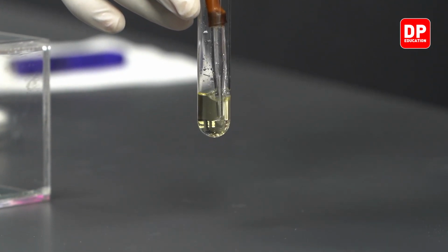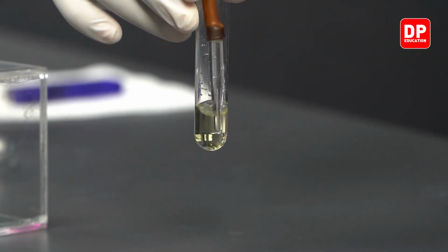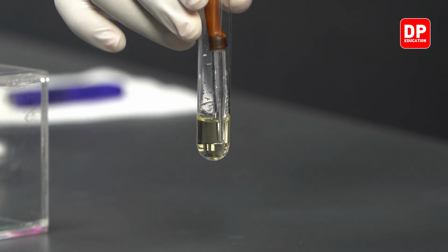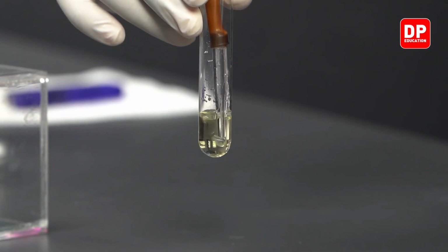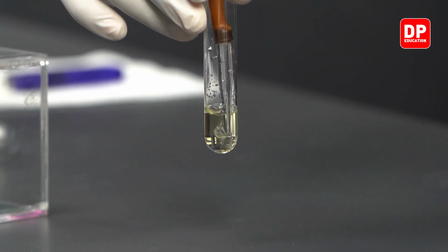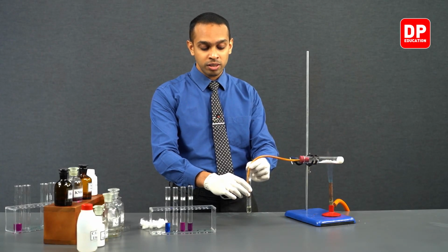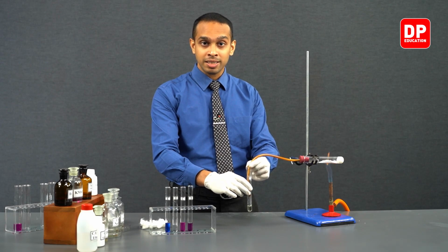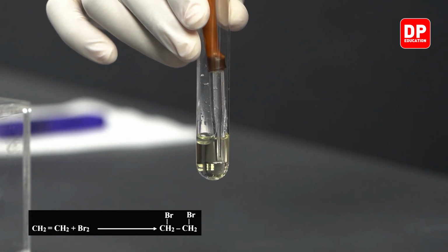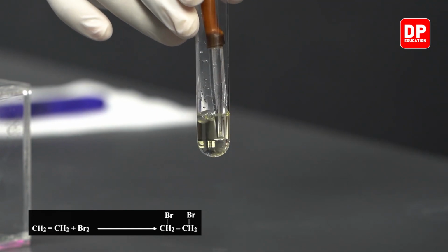Is the gas that is produced decolorizing the bromine water? Do you observe the color of bromine water changing? The answer would be yes. The color of the bromine water is gradually decreasing. As ethene gas comes into contact with bromine water, ethene will react with the bromine in this bromine water, and as bromine gets removed from this aqueous medium, the yellow or yellow-brown color that you observe here will disappear.